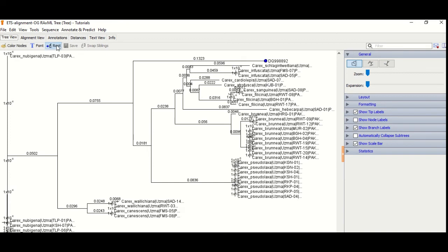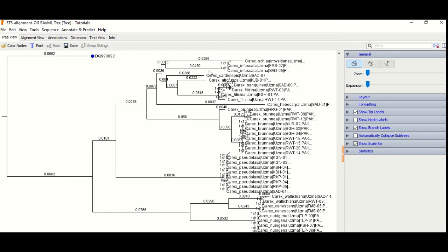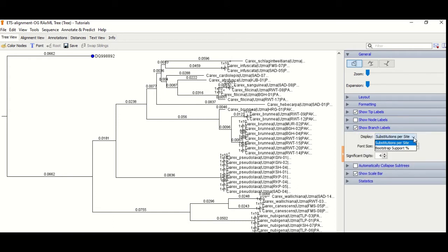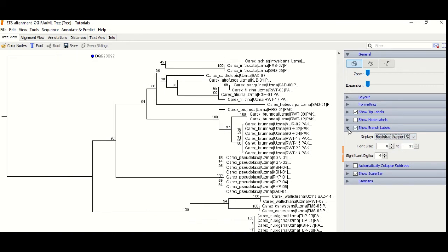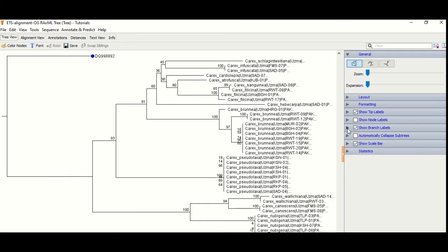We click on the branch to root the tree, so it becomes rooted. Then we check the branch labels and enable support bootstrap values, so bootstrap values appear on each branch. You can see that there are three clades, and the outgroups are from different groups. The bootstrap values are also very good.